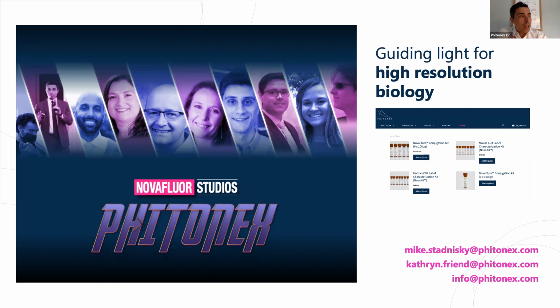On the beads, I know we've used the Thermo beads, and they've just released essentially a quieter red version of their beads. A lot of that is probably due to the fact that the gain is really turned up on the Aurora in the red to separate two red markers in the 600 to 700 range, right?